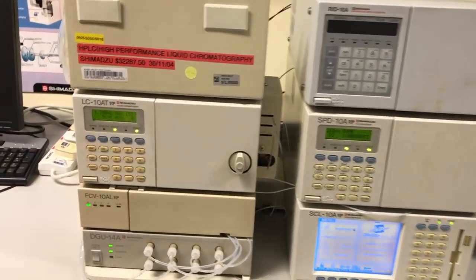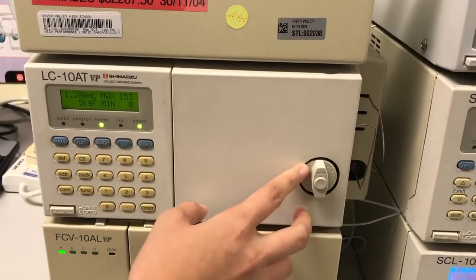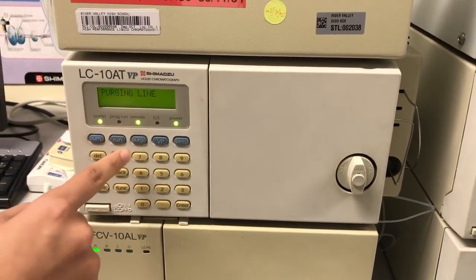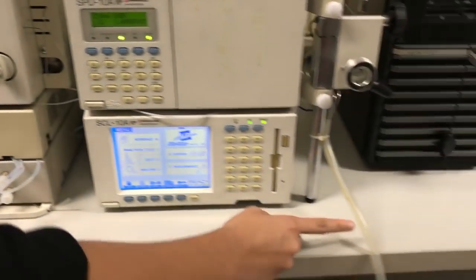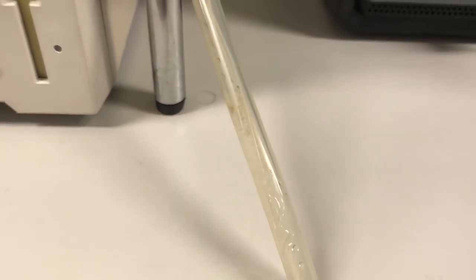So before you do any sampling, you have to purge the machine. So half turn the valve, make sure the word drain is facing on top, and press purge. Once you press the purge button, the solution will be coming out from this side. This will take place for about 5 minutes.